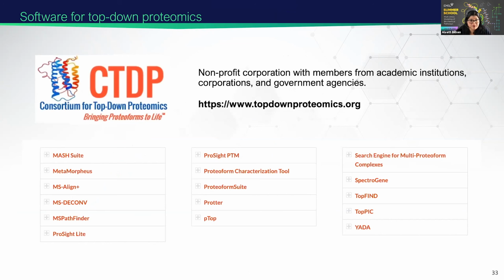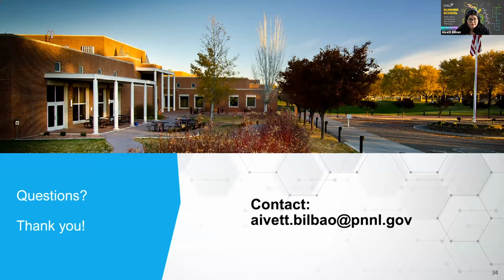Finally, I would like to mention this consortium for top-down proteomics, which is compiling and describing the tools and software that are used for top-down proteomics, if you are interested in performing this kind of analysis. And now I'm open to answer questions, and I thank you for your attention.